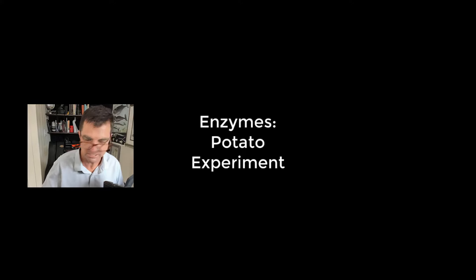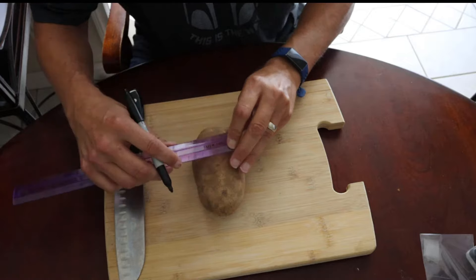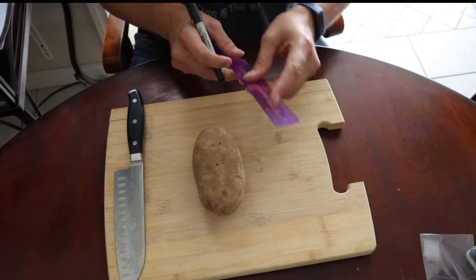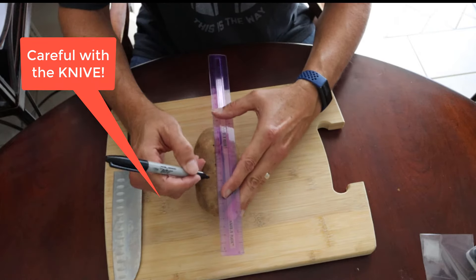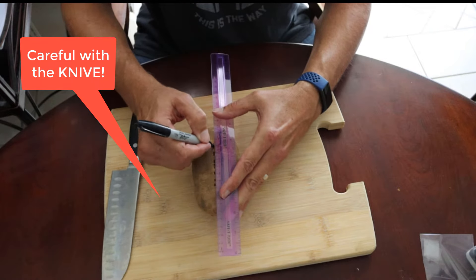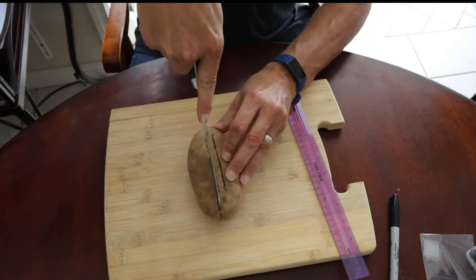This is the potato experiment with the enzyme catalase. The first thing we did was prepare our potato. We made some marks on our potato and cut a one-centimeter wedge in the middle of our potato.